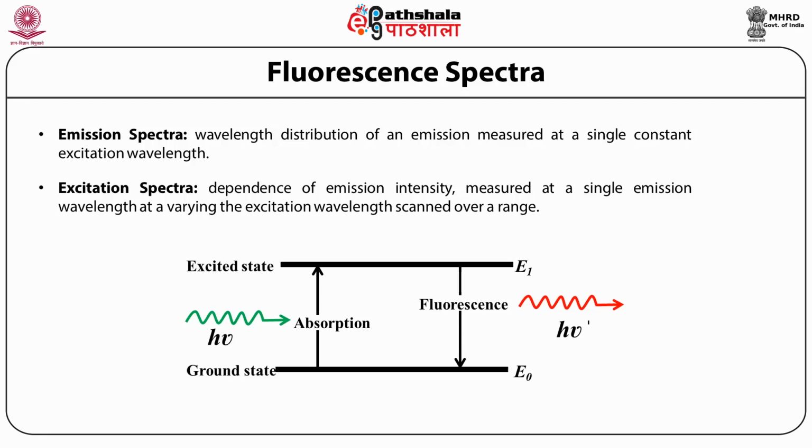Thus, fluorescence occurs at a longer wavelength than the excitation. The energies and intensities of fluorescence give information about the structure and environment of the fluorophore. The fluorescence process is shown in the figure.